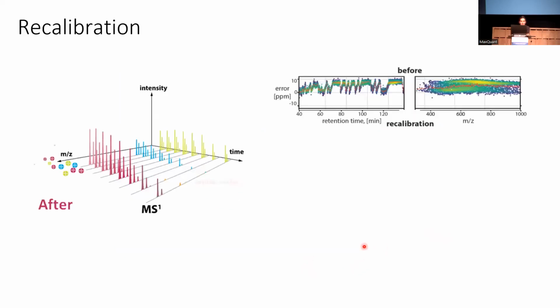So let's see what you're going to do. You're going to run Andromeda scoring, and then you will identify some of the peptides. And I think we're using an Andromeda score of more than 80. So we want to very quickly get some peptides that we are quite confident are identified correctly. That's why we put a default value of Andromeda score of 80, and we keep only the ones that are over 80. So for these peptides, I have their identification.